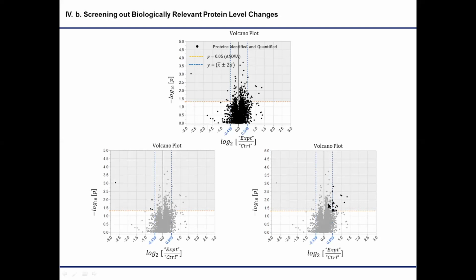So this does not strictly mean this is the only way to go about it, because statistically significant means it is statistically significant according to the data. This approach is a strict methodology, but it is not the best way to go about it. But it is a way to go about it if you want to screen out only a few candidates. So it depends on how you visualize the data. It raises more questions than answers, of course, but it is the way we typically go about isolating different targets.